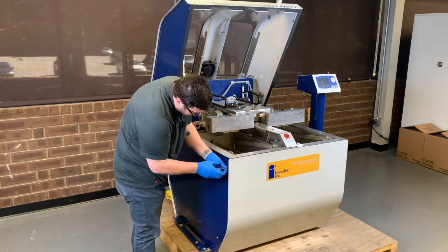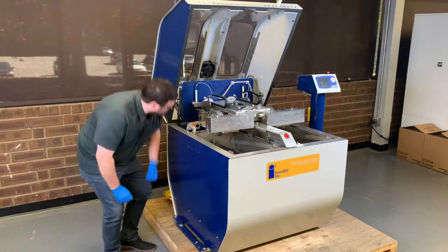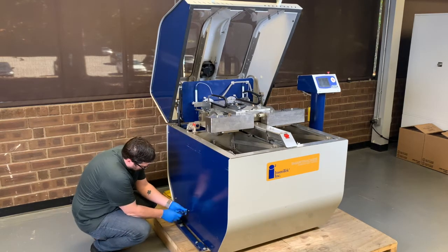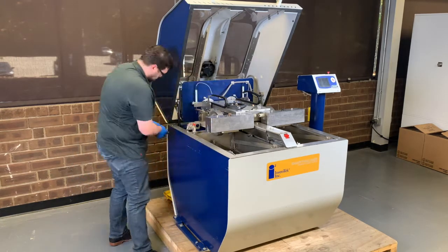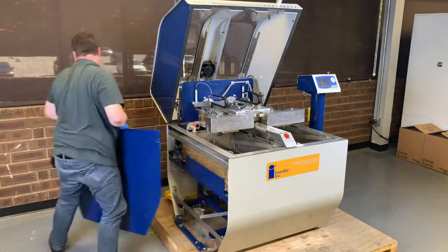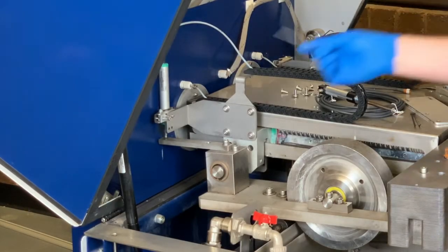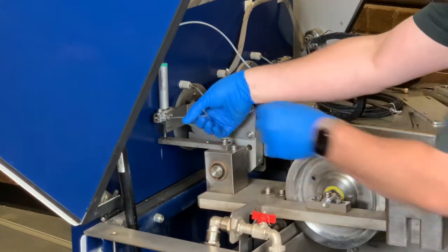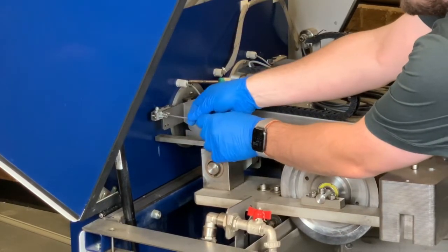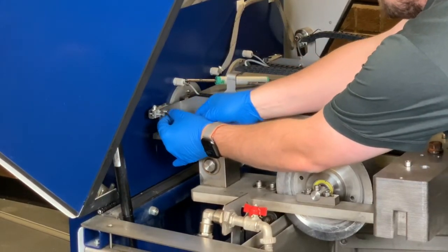Remove the screws from the side. Using a three millimeter Allen wrench, we're going to remove this set screw, which will allow the LVDT to move out of the way. Then remove these two small screws, being careful to keep them because they're needed.